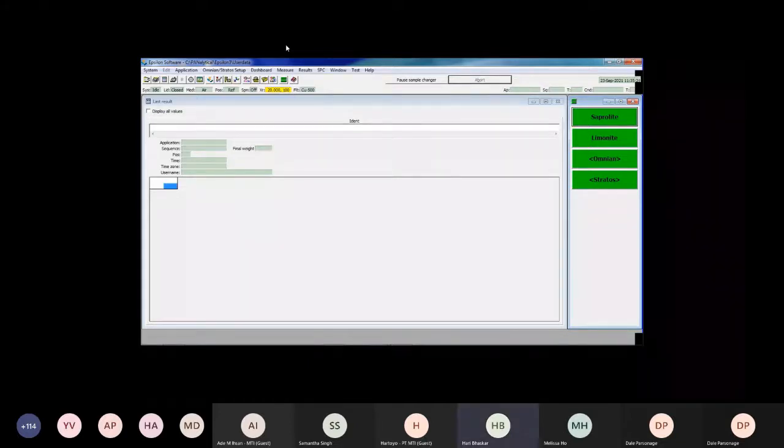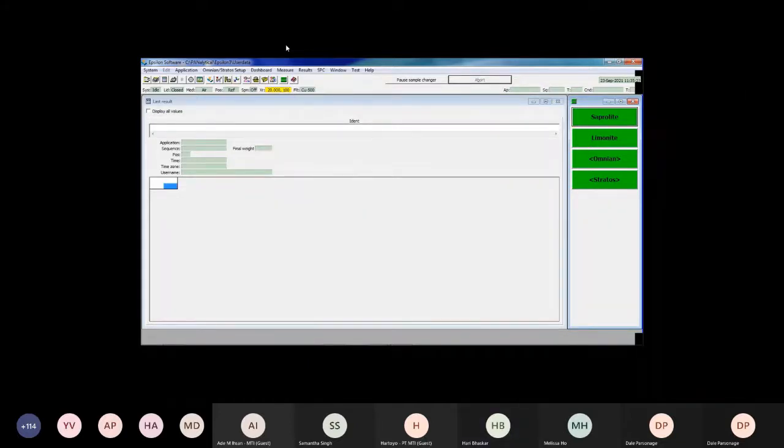So down on the right-hand side of the screen, I have our various methods set up because, being a pressed pellet application, the saprolite and limonite samples are quite different in their mineralogies. They actually have to form two distinct calibrations. And I'll talk about that a bit more when I go through my presentation later.